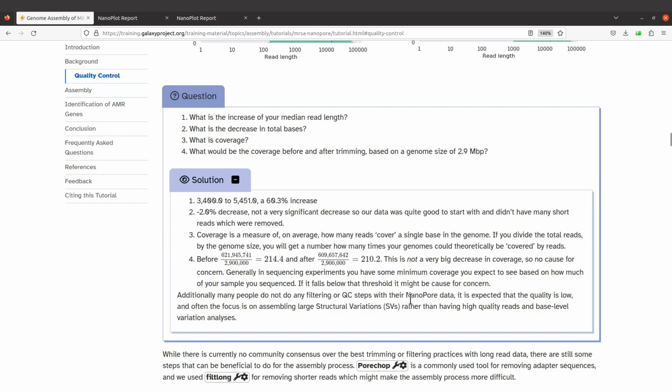So for the coverage, it's possible to compute it. You can use Python, R, or even Bash. I've tried with Bash, by the way. So try your hands on that and let me get your comments or feedback. If you also want to do that later on, you can always contact me and we can arrange a session to do that together. So that's it. Let's proceed.